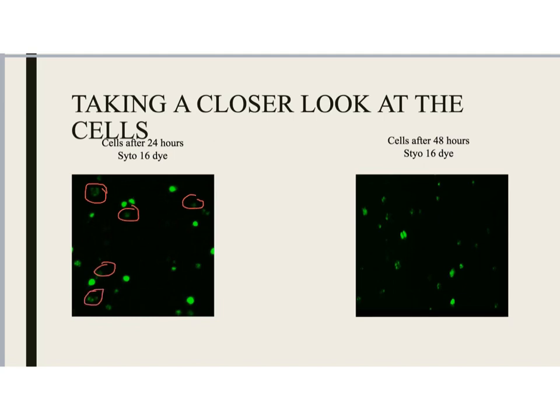And there could be more apoptosis in the neon cells, but with the brightness we had on the microscope, they're not able to be seen to tell if there's apoptosis, because if we were to dim down the brightness, then we would have lost all the other cells that I just circled.